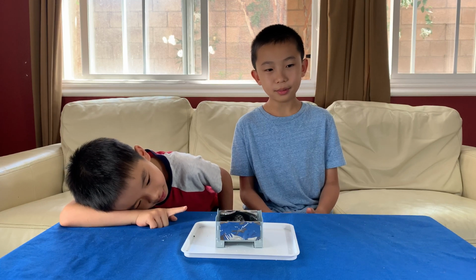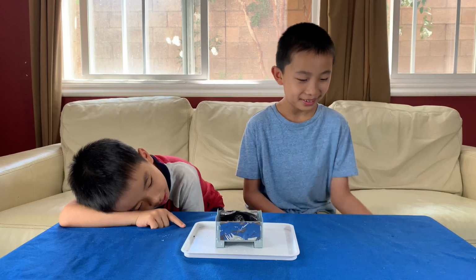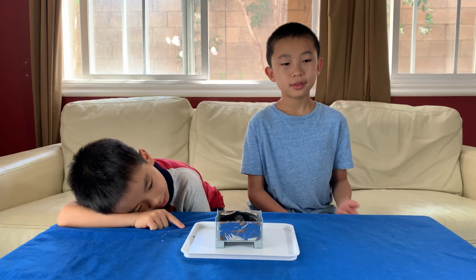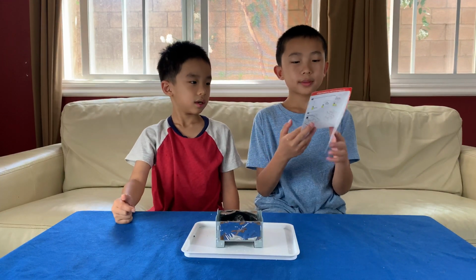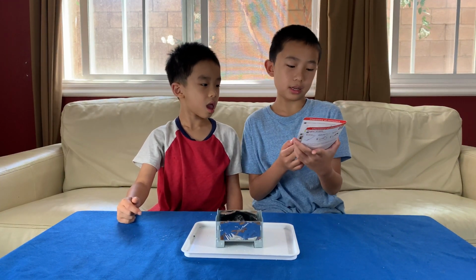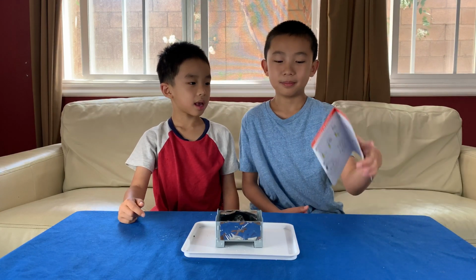And now all we have left to do is clean up. That's going to be so fun. Oh yeah, how do you dispose of this? Was it in here? No, this one. Oh, okay. The way we dispose of this one is we just put it in the household garbage. That's easy.